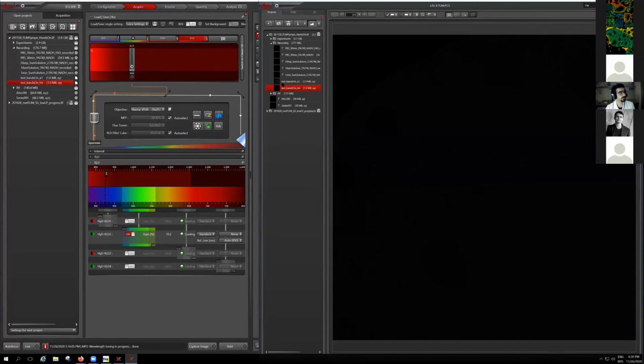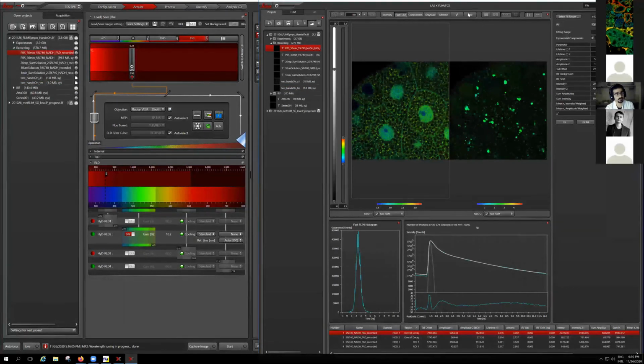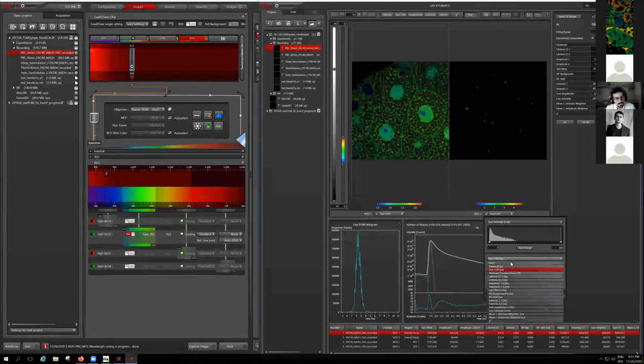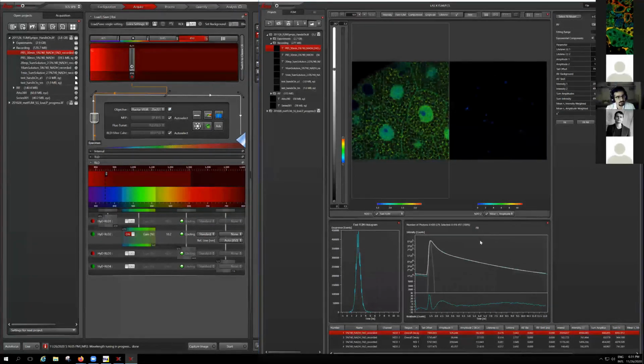So I just go back to the FLIM module and show you how that looks, because it's showing a nice overlay with the proper pixel resolution from the multi-photon imaging, intensity-based imaging overlaid with the lifetime data on top of that. And this is how it is typically visualized. In the free mode, I'm going to say that the brightness comes from the whole intensity, and the lookup table that I would like to have is the mean lifetime.